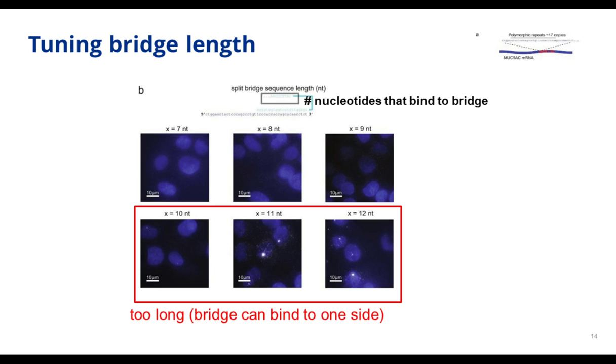The first thing we tried was that we reasoned that in order for this complementation hybridization idea, or this split probe idea, to work, we need the probe to not fluoresce when it's by itself, and only fluoresce when two probes are together, right?